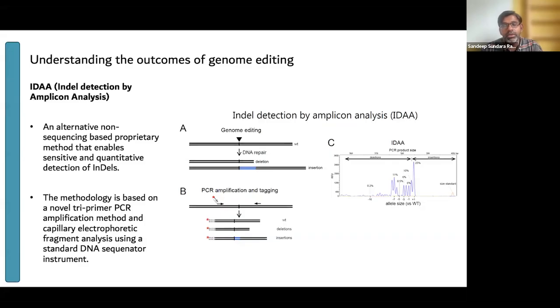That means each company has its own favorite guides, and all of them have different off targets. So it's all prediction based. If you're looking to actually look into off targets, performing this with confidence would be a bit more difficult.